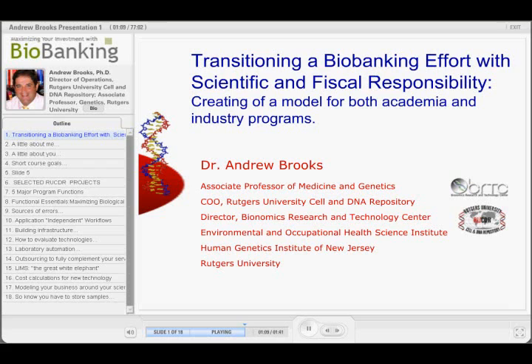And this is being driven by a number of different factors, either by your own program, by starting to hear what people are talking about in the community with respect to raising the bar for quality control, and also potentially considering monetizing the samples that you have, whether to expand them for more research or more things within your own program, or even from a collaborative sense, where you would like to provide your samples, whether as a fee for service or strictly in a collaborative sense to other groups and other programs.